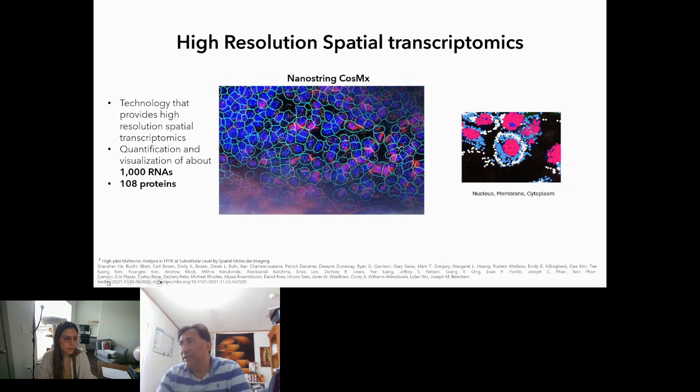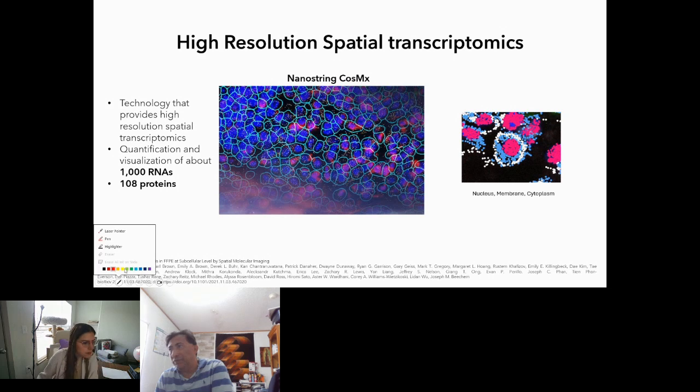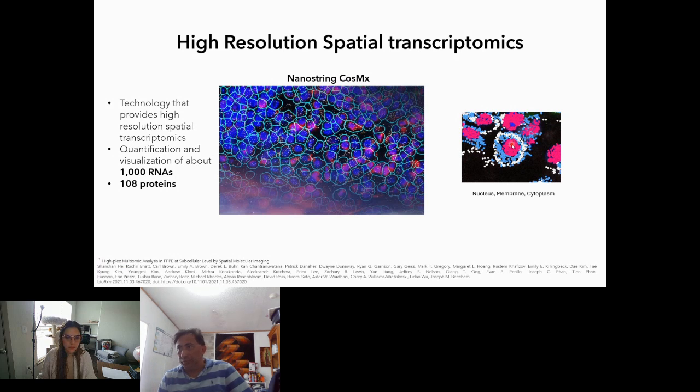And on the right, we see the transcripts, where we identify for a few cells on that plot some of the transcripts by the different region in the cell. The membrane are the white ones, the blue ones are the cytoplasm, and then the nucleus is in pink or red. So each dot corresponds here to a transcript. We define this color just based on the estimation of where they are located within the cell, just to give you an idea of the resolution. So imagine the cell in the center. That is about the number of transcripts that we have for that cell. The number of dots that we see in the image is the number of transcripts that we have. Next one.